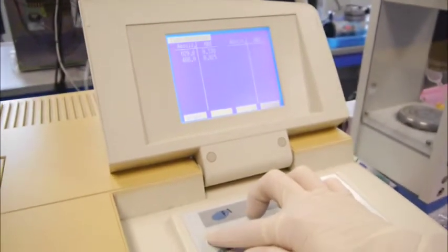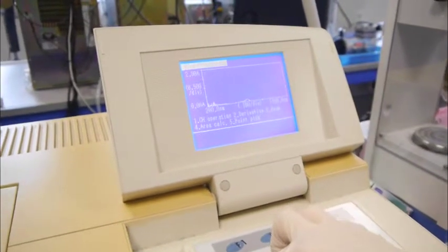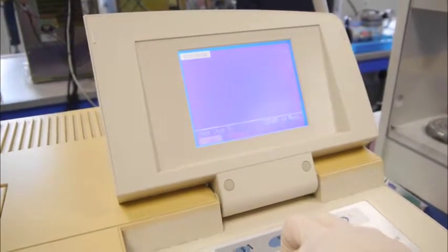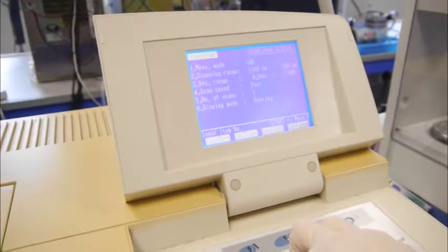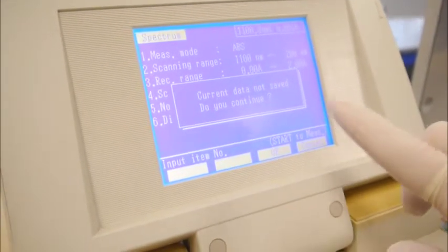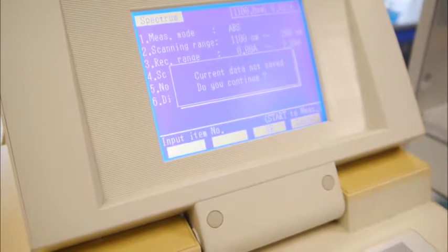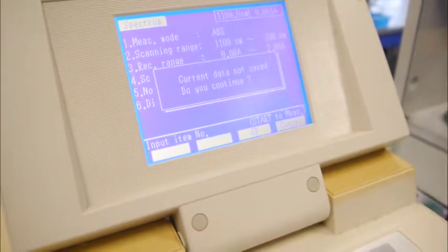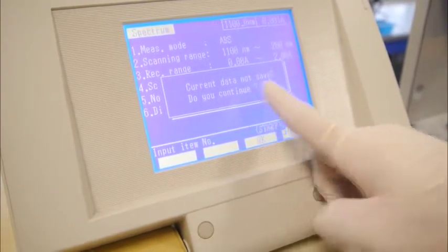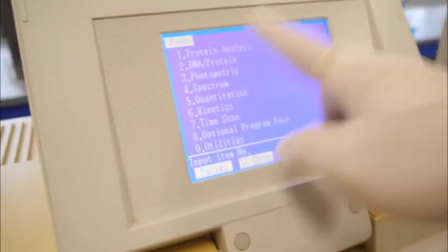Once done, we will return back to the main page. Once you have determined the lambda max value, you will go back to the main screen of the spectrum mode. Then you can press mode, but once you press mode, a window will appear stating 'current data not saved, do you want to continue?' — you just indicate OK, F3. Then you go back to the main screen, which is the list of measurement modes.